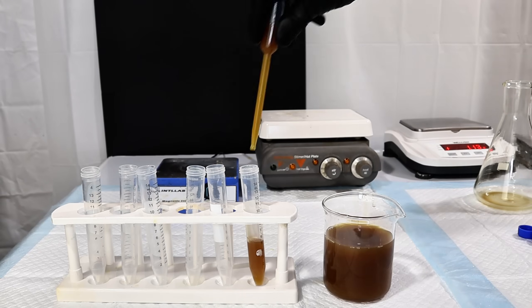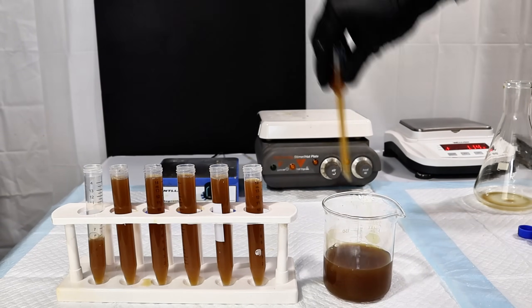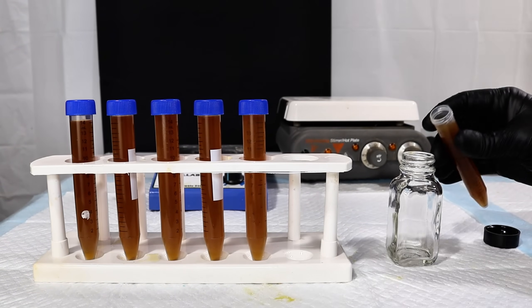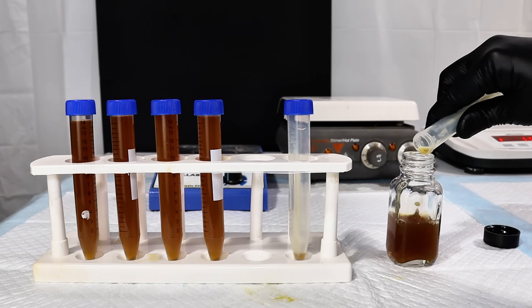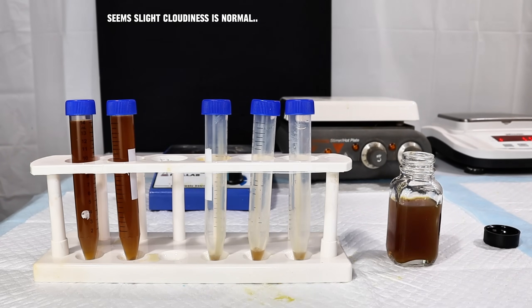As a quick side note, I did think at first that the cloudiness of the tannin mixture was due to tiny bits of plant material in the extract, and so I did try passing some of it through the centrifuge at 5000 RPM to clean it up. However, this did absolutely nothing, and so I'm going to guess that some amount of cloudiness is normal.